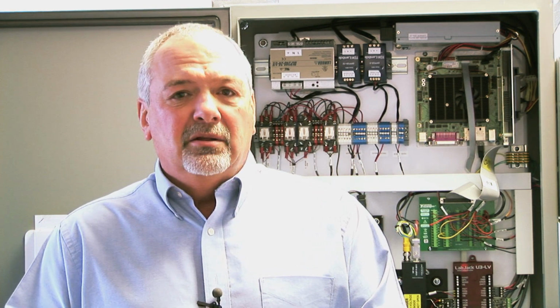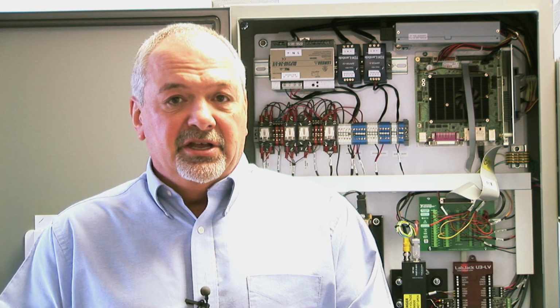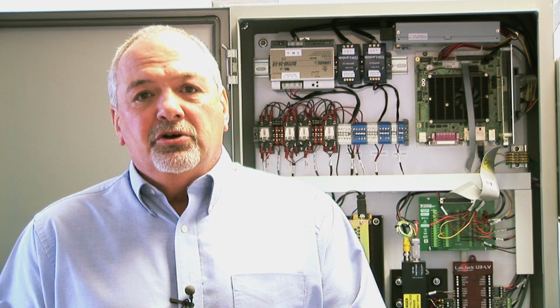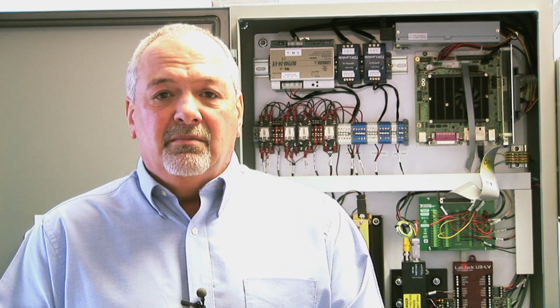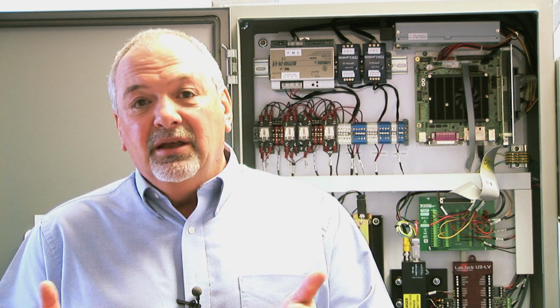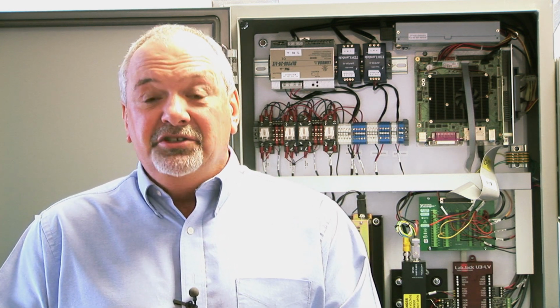They very quickly got to the point with total suspended solids and BOD that they were ready to do proficiency testing. This is third-party proficiency testing that was introduced into the sample stream, and they measured that, came up with a result as compared with the true number as provided by the proficiency test provider, and they nailed it. And we're talking BODs very low, less than 3. In fact, I think the first PT test that we nailed was 2.75, and those digits are significant with this instrument.